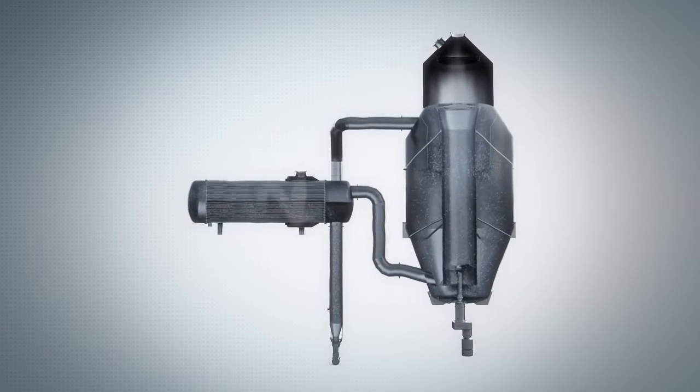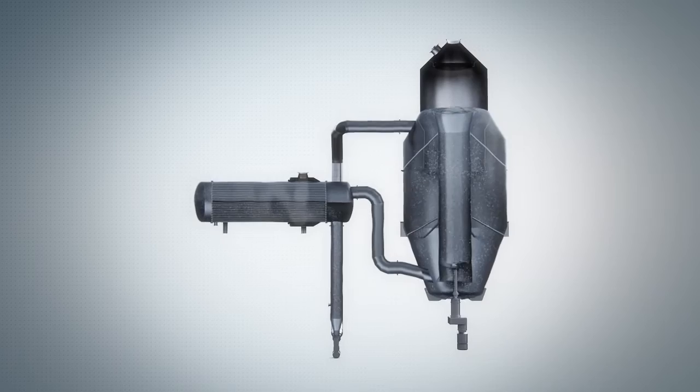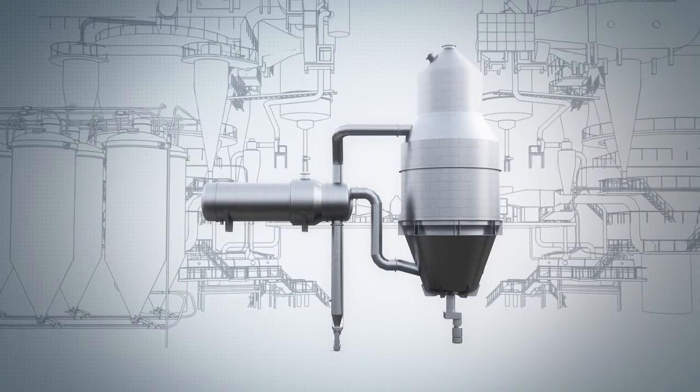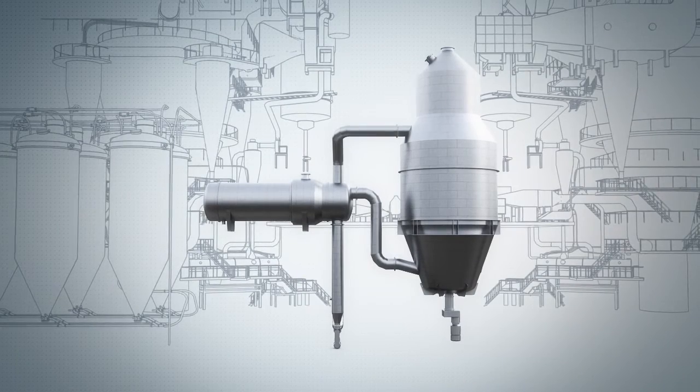Quality and energy efficiency is the building block of the GIA DTB Crystallizer, and we are proud to offer a unique, state-of-the-art crystallizer capable of meeting the highest expectations.